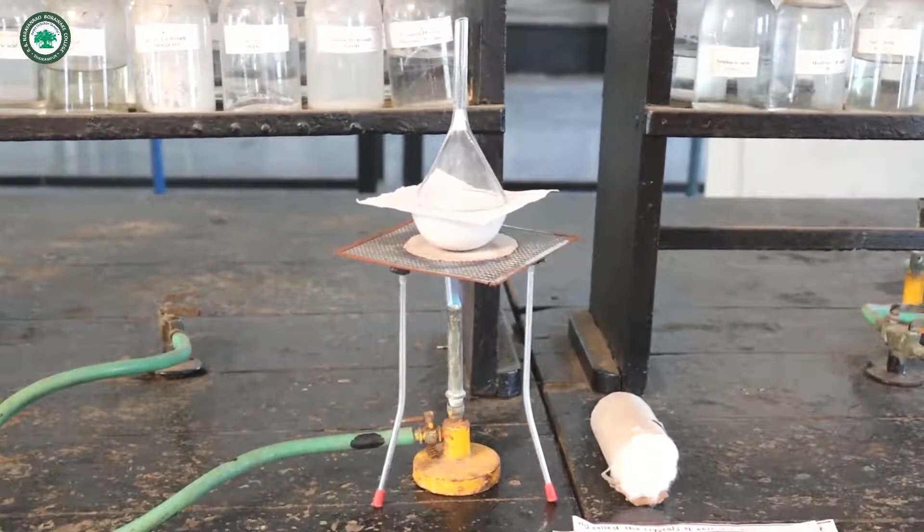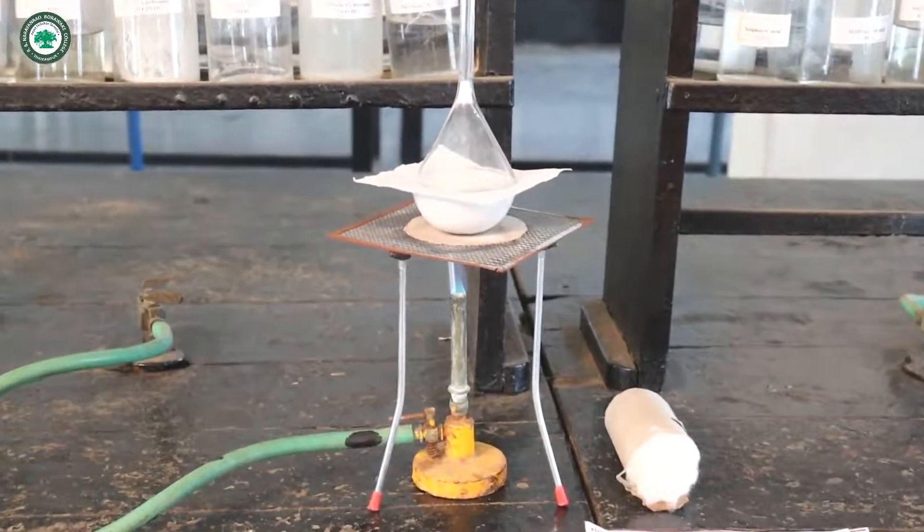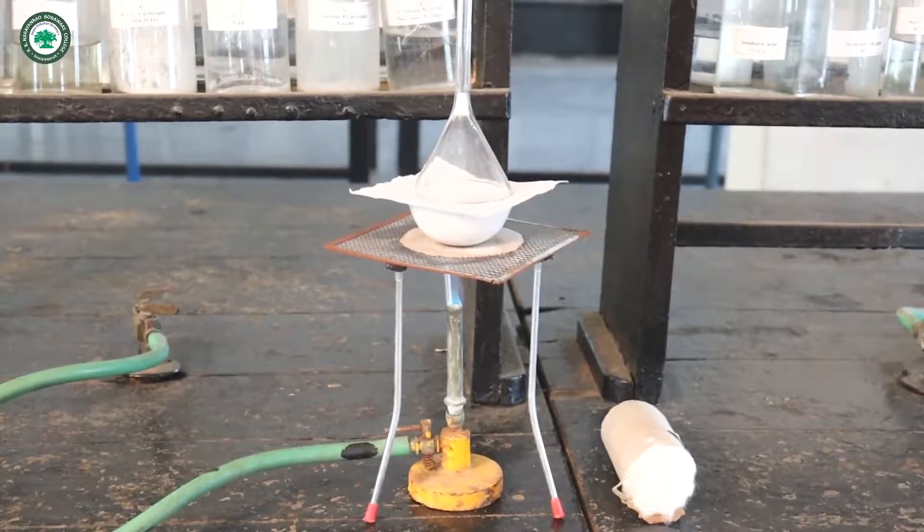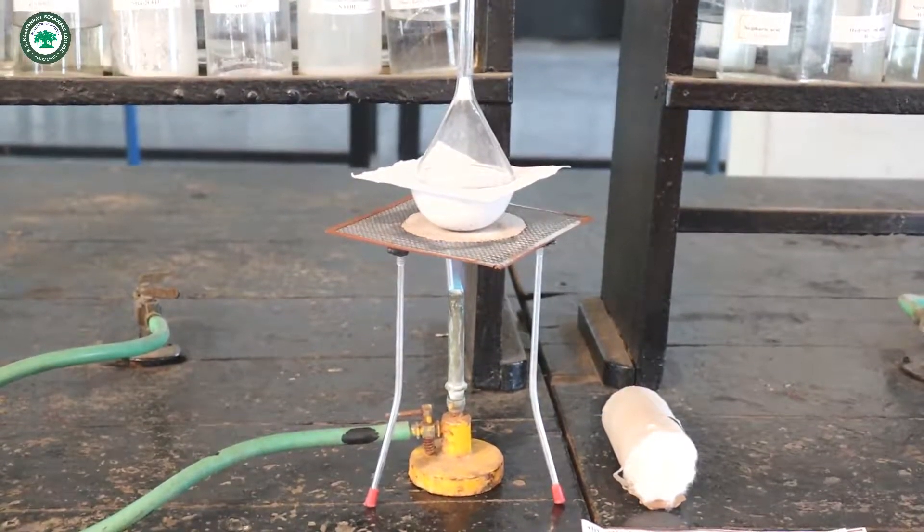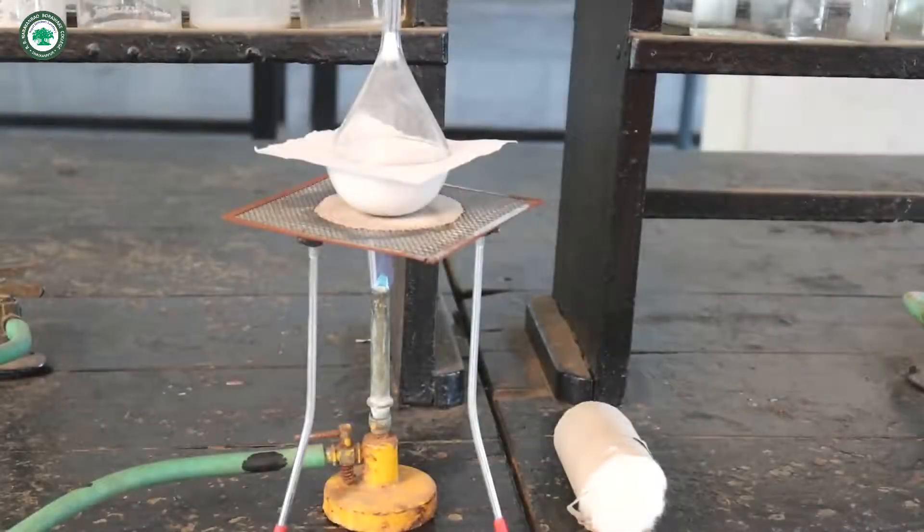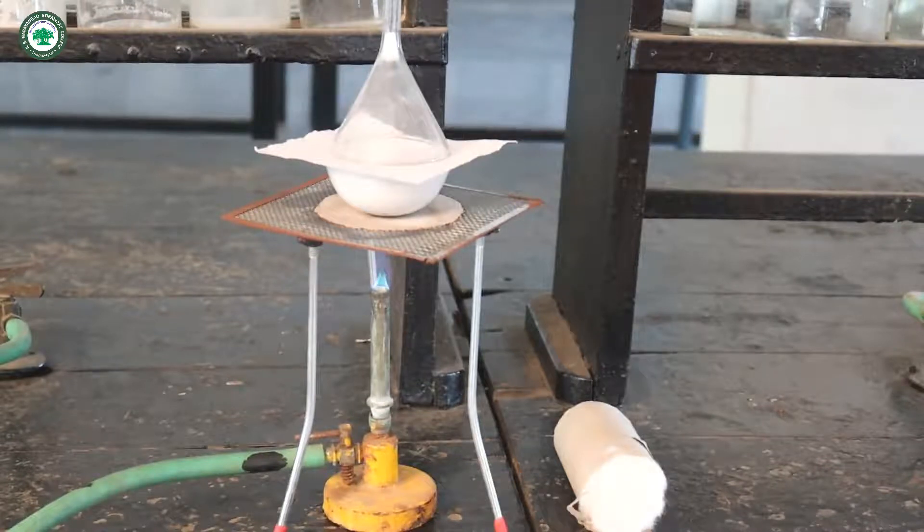After some time, crystals of phthalic anhydride start to appear on the inner side of the funnel. Now it is observed that small amount of needle-shaped crystals starts to appear on the inner side of the funnel.